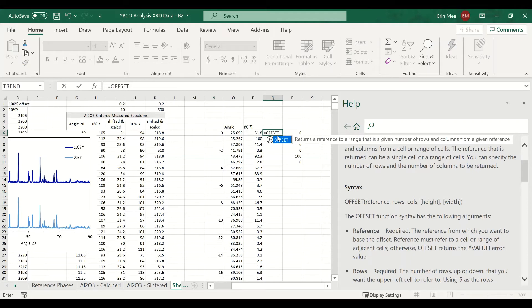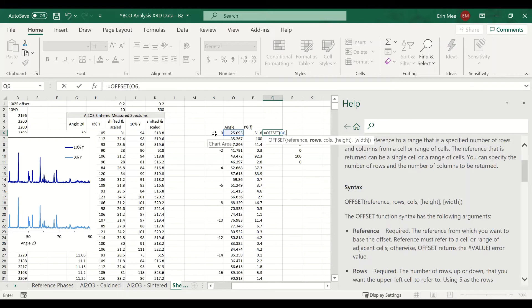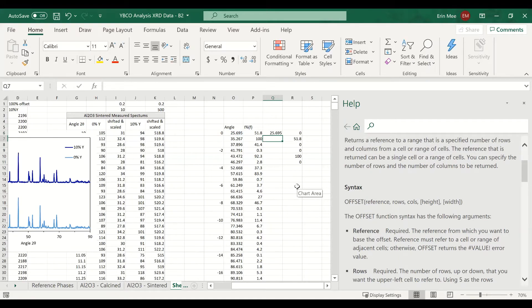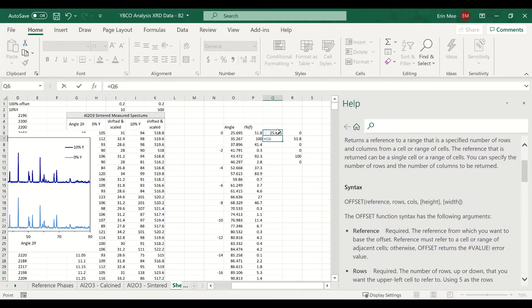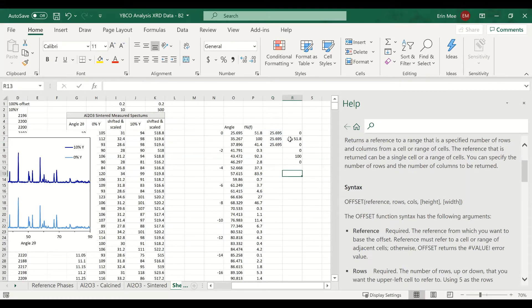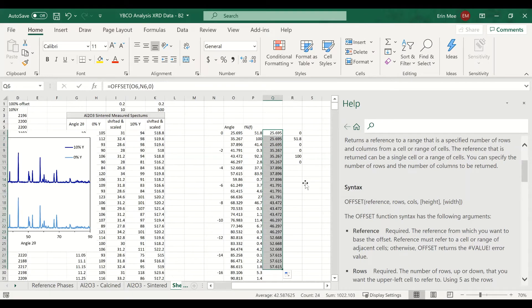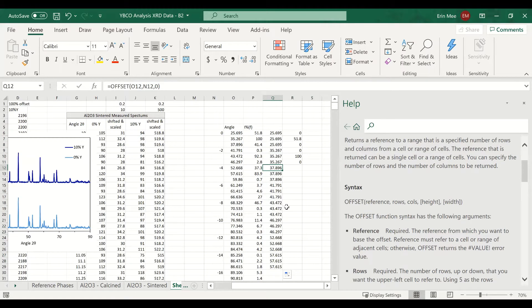Using OFFSET: reference this cell, use the index value for the number of rows to go up, and zero for columns since we don't change columns. The next cell down just references this cell directly, and the one after that the same. Then grab these and drag them down. So the next cell is 35, then 37, then 41 — that works.